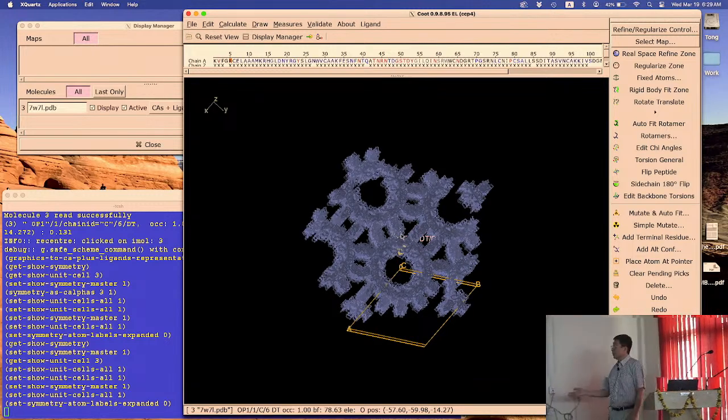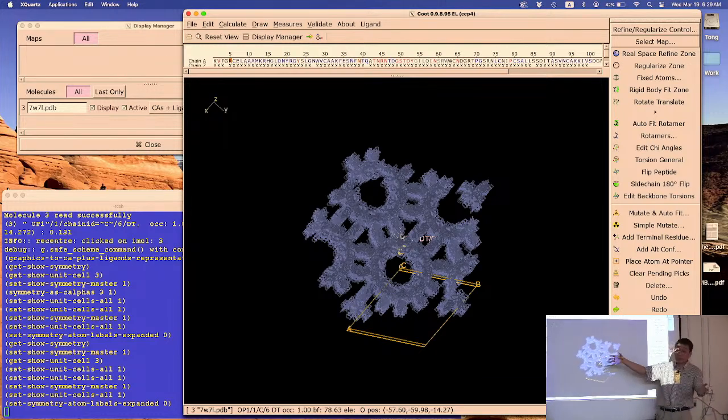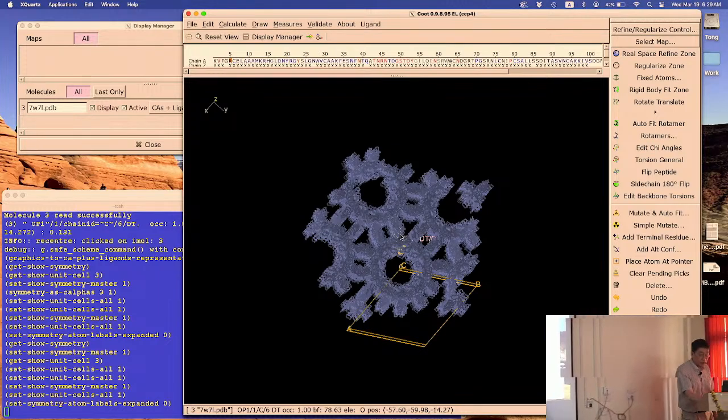Anyway, so the idea, this is just showing you how the molecules are packed into the crystal. And in this case, the packing is so beautiful, almost like a church window or temple window or something. Very beautiful patterns here. And I guess I changed things a little bit.